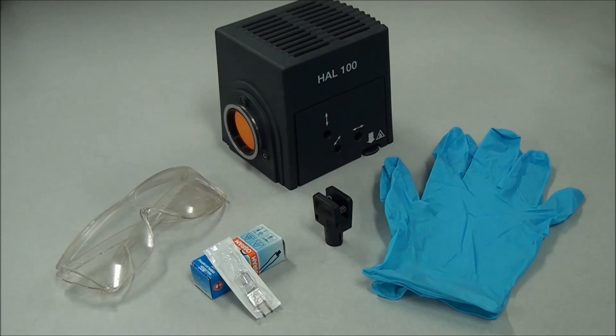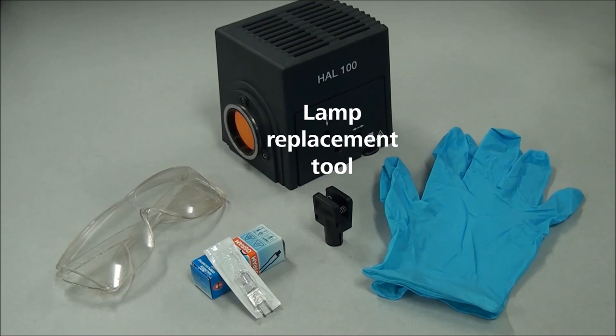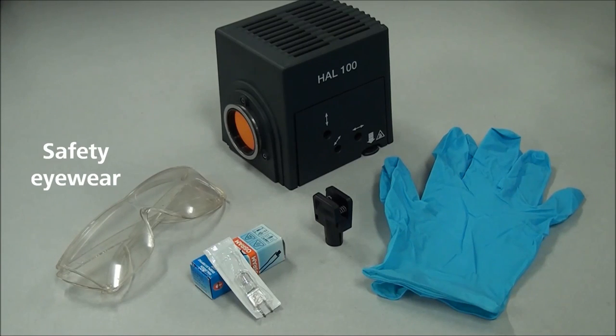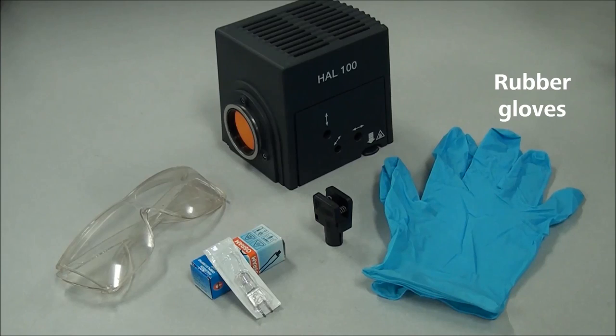When it comes time to change the bulb, follow these simple steps to complete the process. You'll need the following: lamp replacement tool, a new HAL bulb—make sure the voltage of the bulb matches that of the HAL unit—safety eyewear, and rubber gloves.